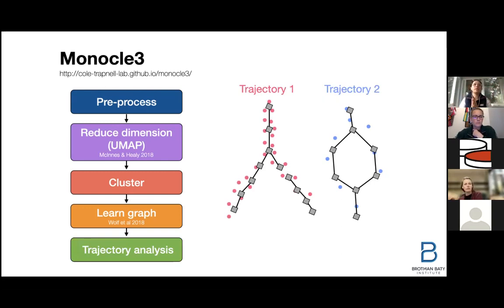So you can see if you start from a certain group of cells and they branch off onto like 3 different paths, then how the gene expression changes with cells branching off into different paths.